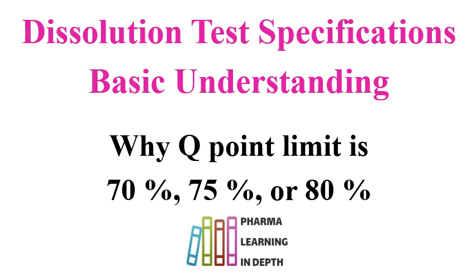Sometimes two Q points are given for the low soluble molecules, like 50% dissolution and 80% dissolution as two Q points. So I hope this video will help you to understand dissolution test specification, basic understanding, and why 100% dissolution is not required or recommended or feasible, and why you can give the Q point limit of 70%, 75%, 80% or 85%.